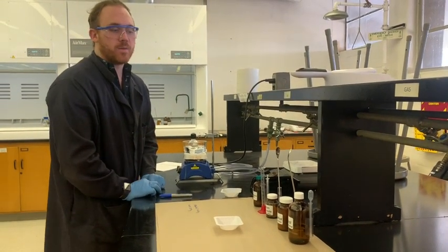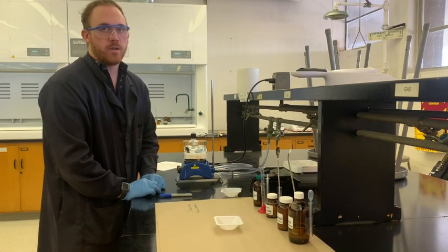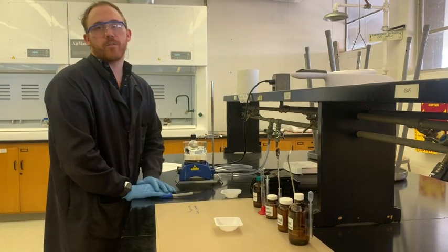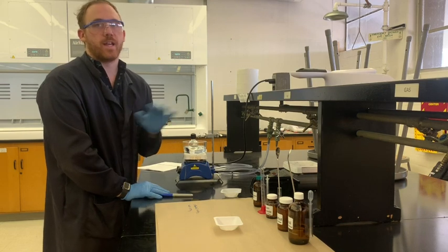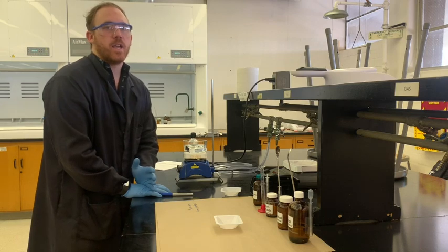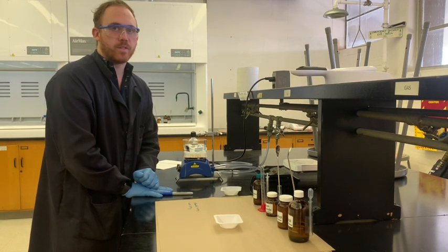If you have 10 milliliters, it can be 11 or 9 milliliters. The big important thing for safety, in case you have some kind of runaway reaction, is that you always work in flasks that are—you never work more than halfway full in any flask. So you should think about all the combined volume of your reagents and try to pick a flask double that size if you can.